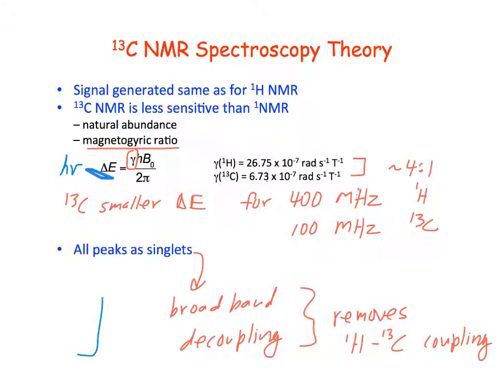If you have a singlet like this, it's hard to see these unless it's kind of away from everything else and the spectrum is not noisy. But down here, you can oftentimes see a pair of satellites like this. Those are called the C13 satellites.